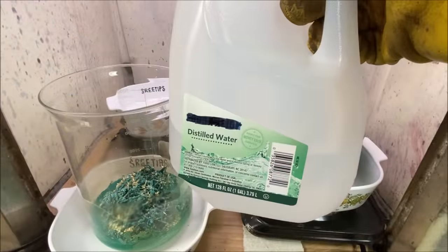Get some of the solution on a piece of filter paper. Let's do a stannous test, make sure we've got all the gold precipitated. As you can see by that lack of stain on that piece of filter paper, all the gold has precipitated. We're almost home. I'm gonna pour this waste solution off. Here's our gold down here. It's a respectable amount. Pour this waste solution off now. Get rid of it.